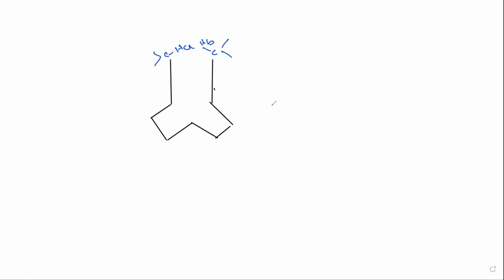In this compound, these two protons are in close proximity.